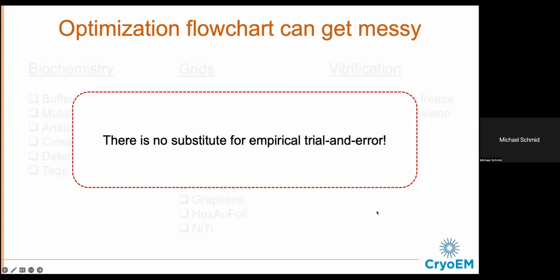No, but I do think the NIH recognizes that this is a big issue, right? And so that's why they've offered supplements to the national centers dedicated to screening specimens. I think it's wonderful that the national centers have so many microscopes to collect data. You guys have all the latest hardware, but I don't want to speak for you, my assumption is that screening grids is taking a lot of your time and remains a huge bottleneck.